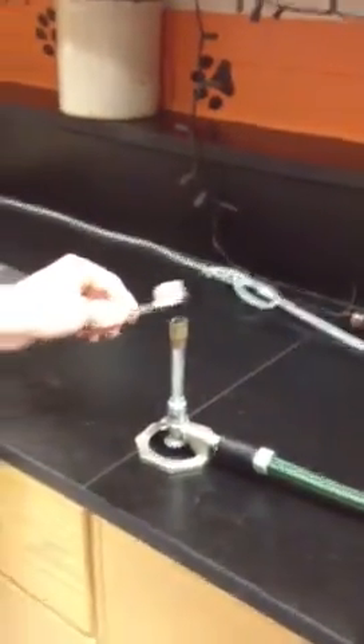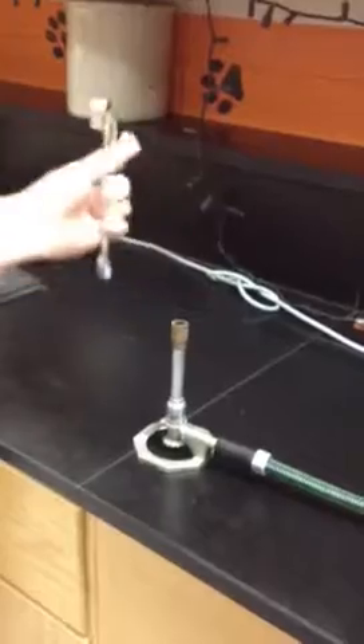Now, in order to use this correctly, you must first make sure the gas is on. Hold it over the Bunsen burner and make a spark until it lights on fire. Here you go. Okay.